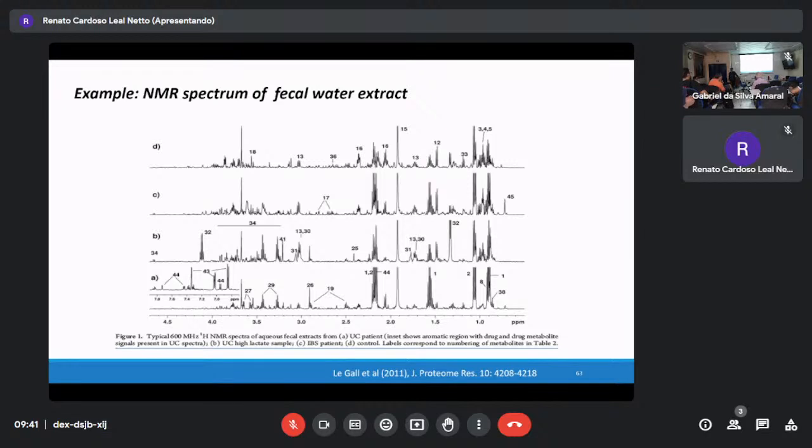Snake. Viper. My colleague in the Netherlands collected all the vipers, king cobra, black mamba, barracuda, and he took out the sample to measure metabolism. He also provided spider venom, snake venom, and scorpion venom. Now, all these samples, first start with this one.